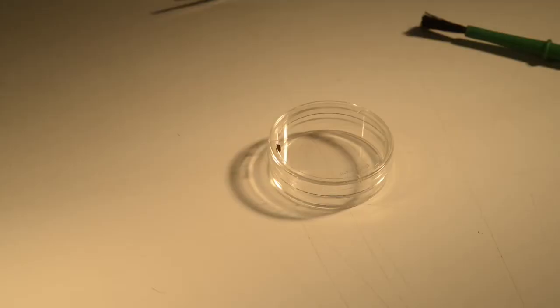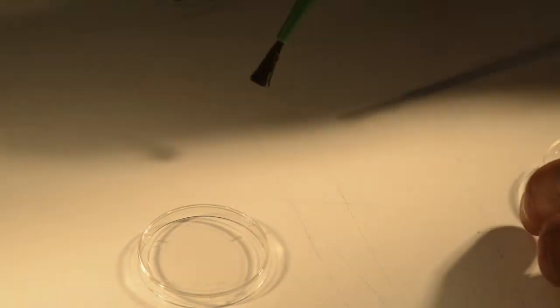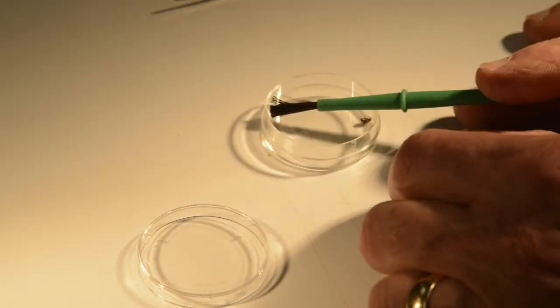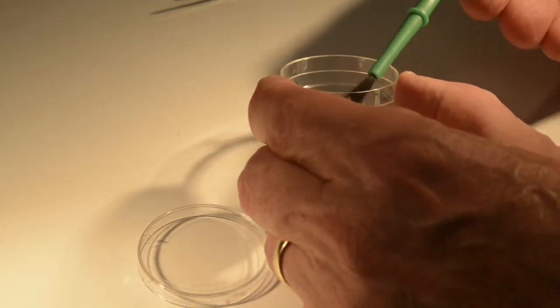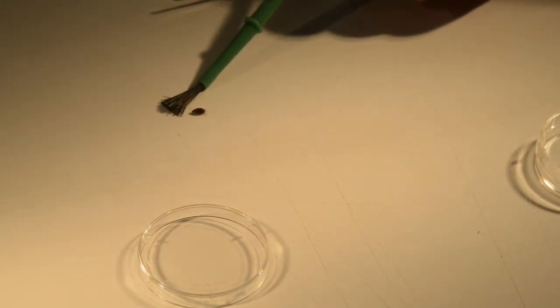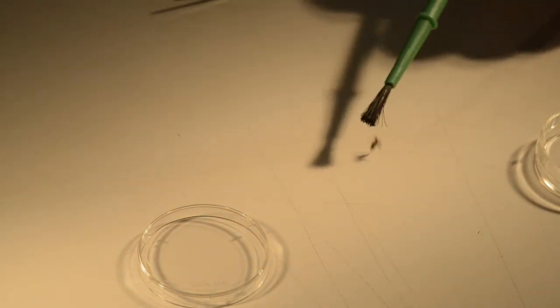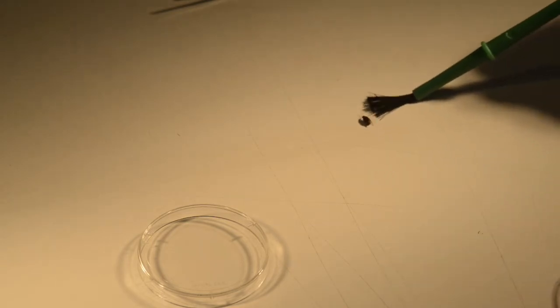I also want to show that you can handle the beetles with a small brush — a small paintbrush. A Drosophila brush or just a small watercolor brush is sufficient to manipulate the beetle much the same way you would with forceps. You can pick it up and put it into a dish.